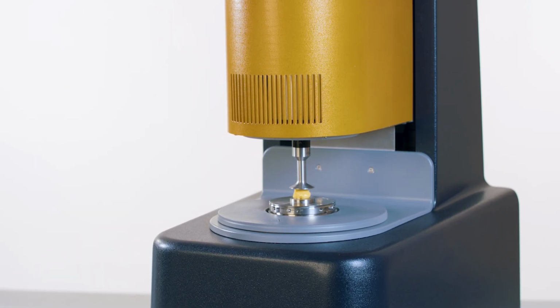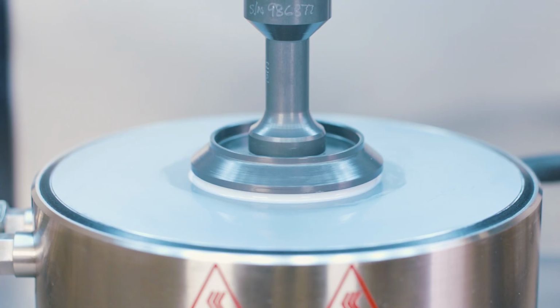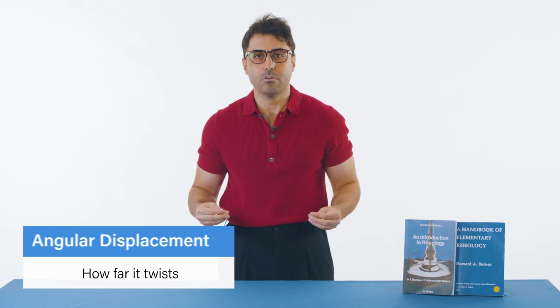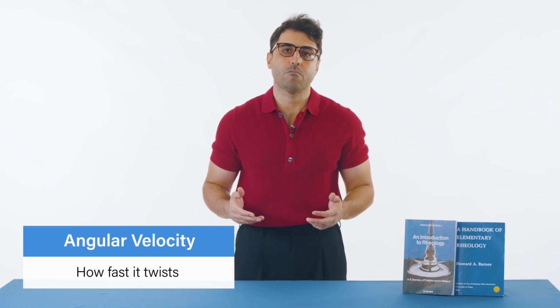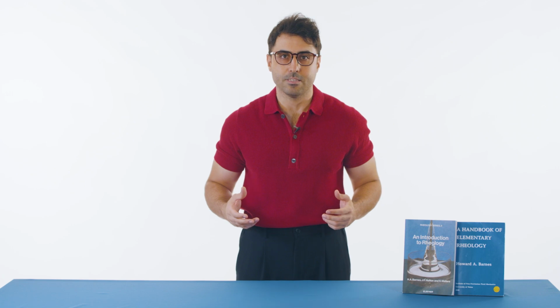So how does a rheometer actually work? It applies a force or motion to a material and measures how the material responds. The raw signals it collects include torque, the twisting force, angular displacement, how far it twists, and angular velocity, how fast it twists. But these are just raw signals. To get meaningful rheological properties, we need to translate them.